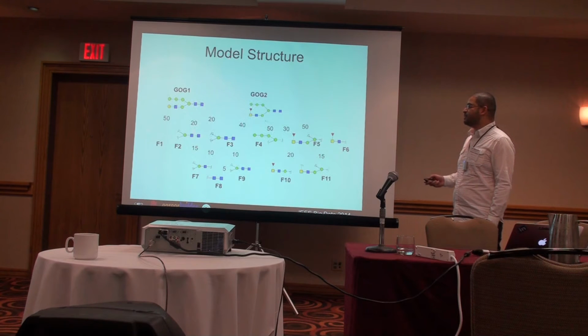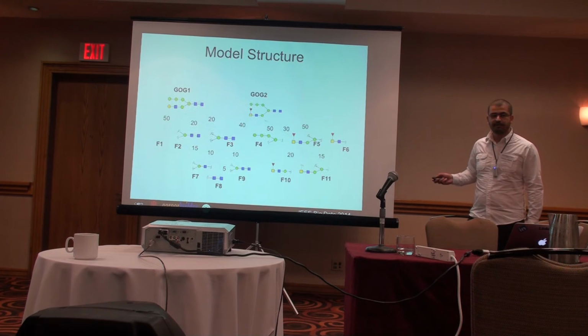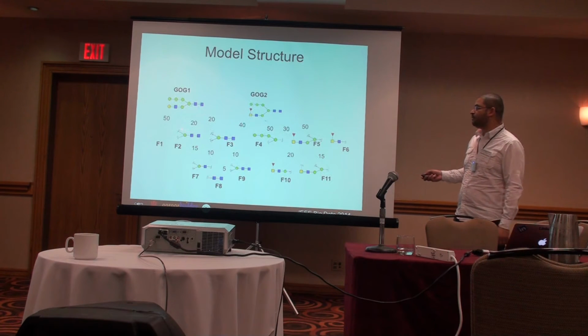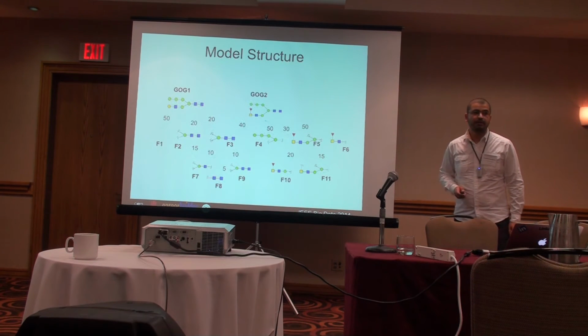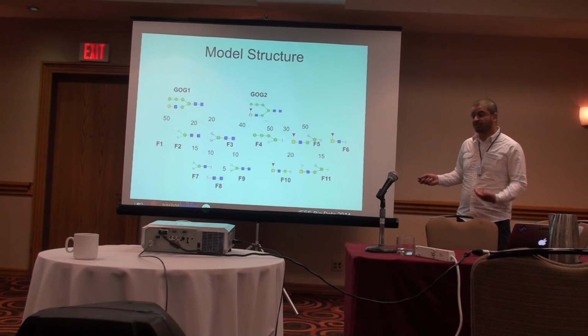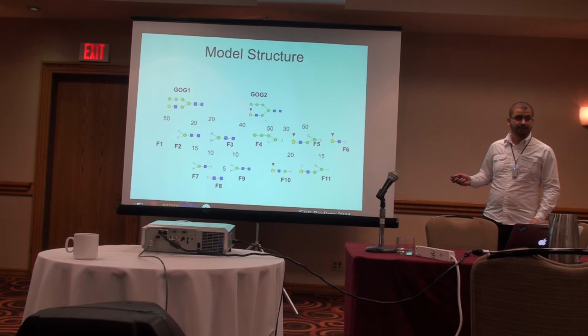And how about those edges? So we said, okay, if this fragment in the training data provided by the users, we figure out that it was generated by this parent, this glycan, we connect them with an edge, and we do so with others. So those numbers on the edges are actually the frequency, how many times we have seen, when we train the model, this piece produced by this parent.